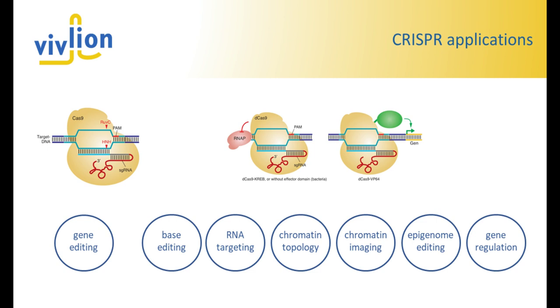So this brings me already to a few introductory words. When we talk about CRISPR applications, of course, we mostly mean, as you will see on the left-hand side of the slide, the wild-type Cas9, in this case SpCas9, where basically a guide will be delivered to a single cell and then induce a double-strand break, which is what we today understand as conventional gene editing to perform single or unbiased gene screens.